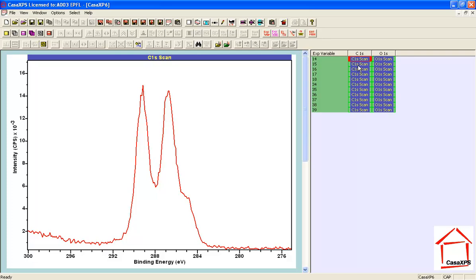Now, if I was interested in performing a fit, say, between the carbon peaks and also potentially introduce some information from the oxygen 1s, then I might want to have a single peak model that applies to both carbon and oxygen. And I can create a VAMAS file that will give me the ability to produce peak models of that nature if I use a toolbar button to select the data from the right hand side on a row by row basis for display in the scroll list.